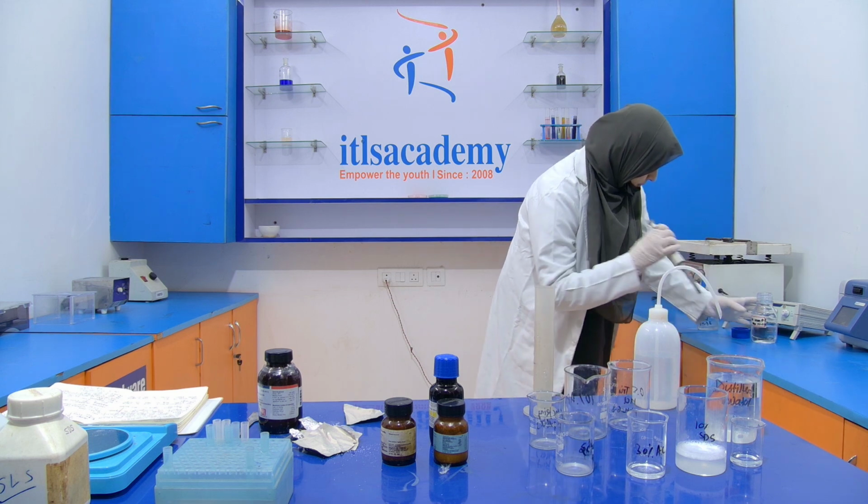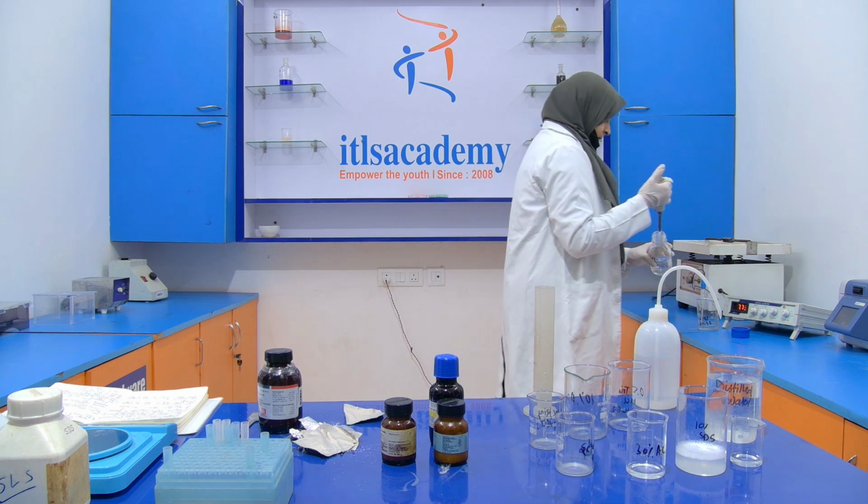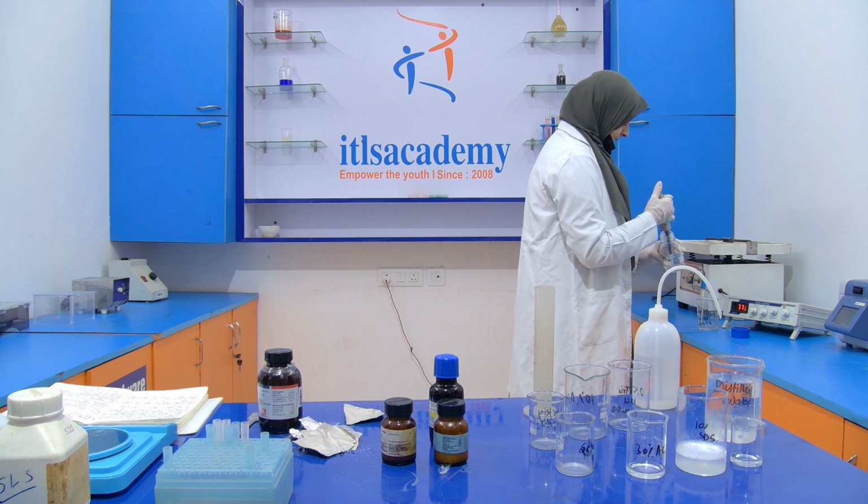Now it has reached 7.7. More NaOH will be added for maintaining its pH.